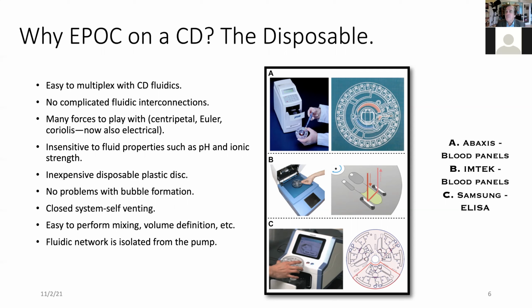About 22 years ago when we invented this, pretty much all of these functions have been demonstrated. And importantly also, the fluidic network is not coming in contact with electronics or the pump or the motor. The pump is actually the CD, right? But the motor that spins this, you don't want liquid to go on there, but that's nicely isolated.